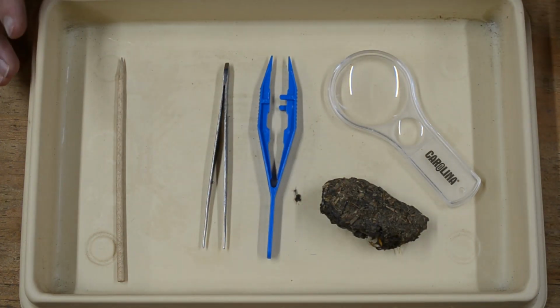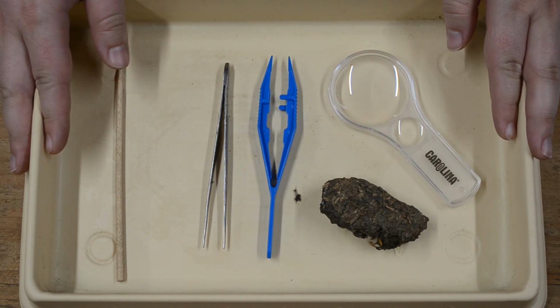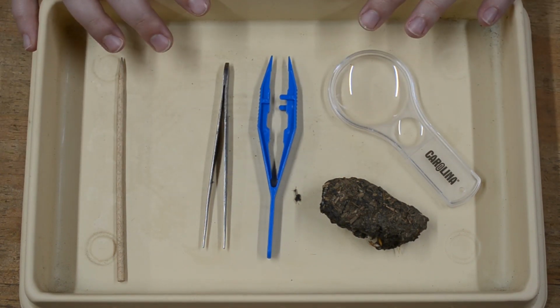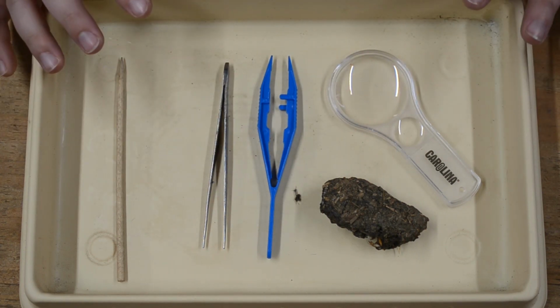For our dissection programs, we provide all of the materials that you need. So to set up our dissection area, we have a plastic tray. These are very helpful for holding the pieces of the pellet as we take it apart. These are really nice, especially when we're dissecting outside, as we often do, where a slight breeze could easily just blow away all of our tiny bones and teeth.